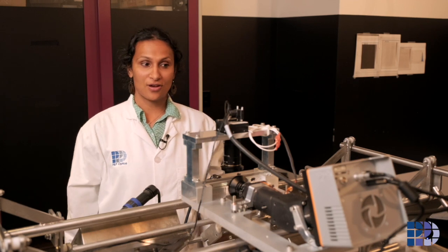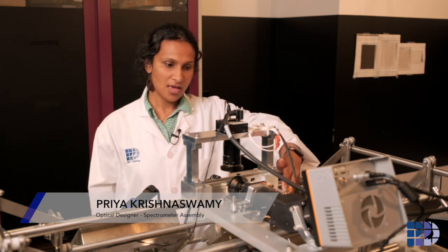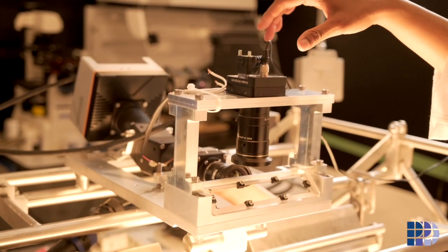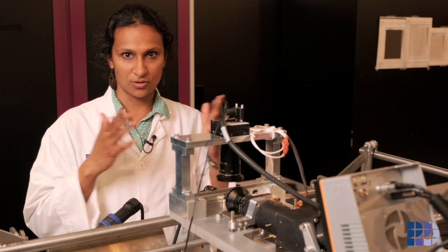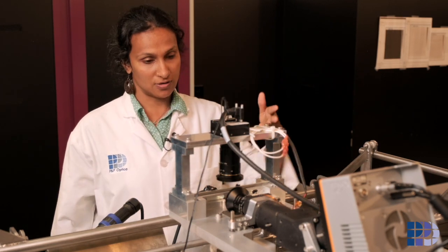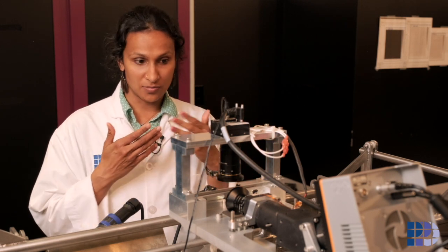Hi, we just saw how a spectrometer is put together, how it is aligned. Now that it is aligned, we are going to put it on a frame. Here you can see the spectrometer, and you can see one more camera out here. This camera is going to see exactly the way our eyes can see, so the visible region, and the spectrometer here is going to see the infrared region. So the next question is, how are they both seeing the same scan line?